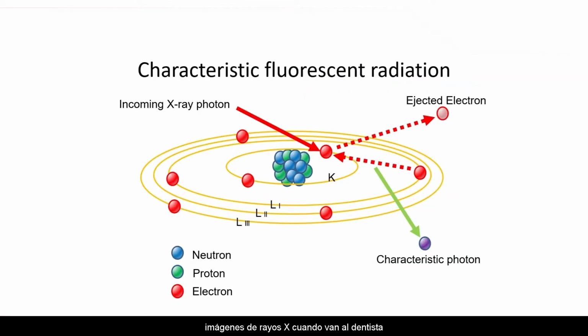Most people think about X-ray imaging when they go to visit the dentist or at the doctor's office, but we use a different detector. We are not looking at density, we are looking at fluorescence. What does that mean? By bombarding the sample with X-rays, as shown above in the photo, the sample becomes excited. And that means all of the elements want to go back to a stable condition. And during this process, they emit characteristic photons. What do I mean by that? There's different energies for different elements. And these characteristics are well known and can be used to identify the element and thickness.